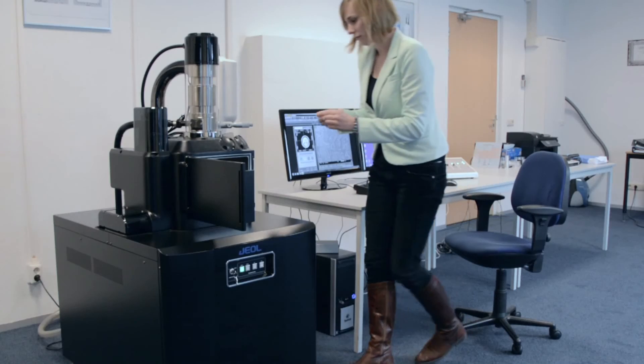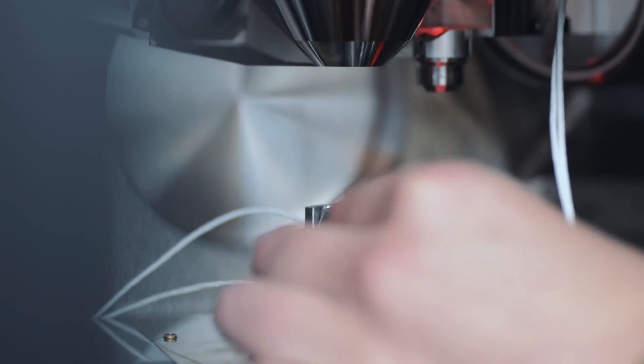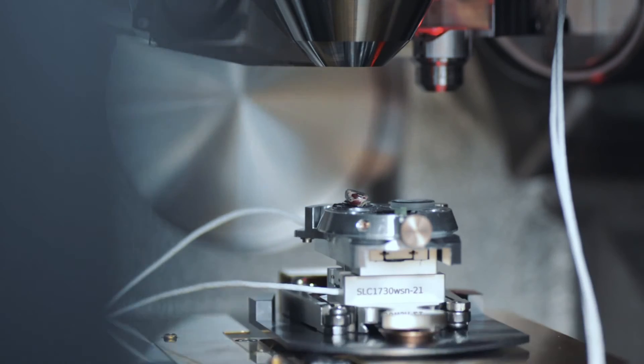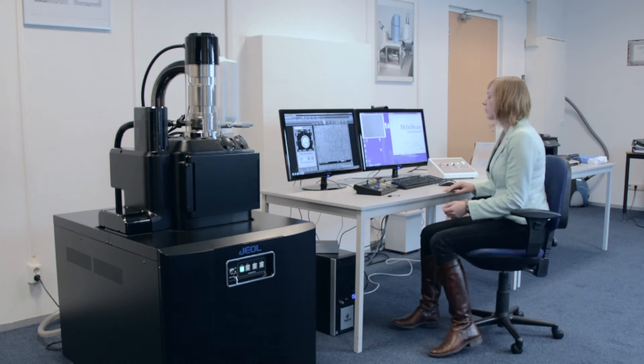The sample holder with a sample is inserted on the substage in the vacuum chamber. A SEM image of the sample can be made at any desired magnification and areas of interest are selected.